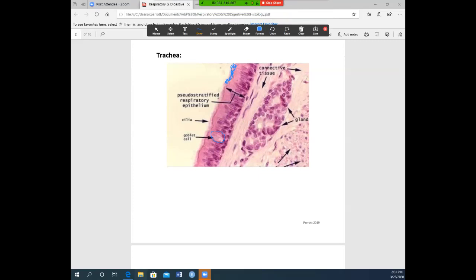Underneath this pseudostratified epithelium you're going to have glands made up of cuboidal cells, so you'll see those round, organized cuboidal cells underneath.